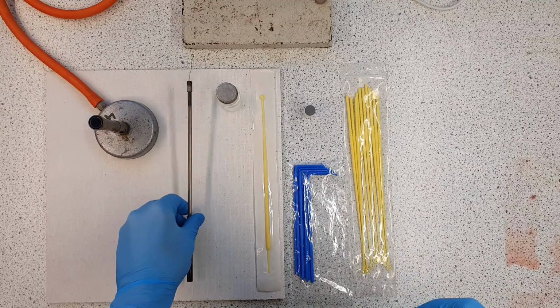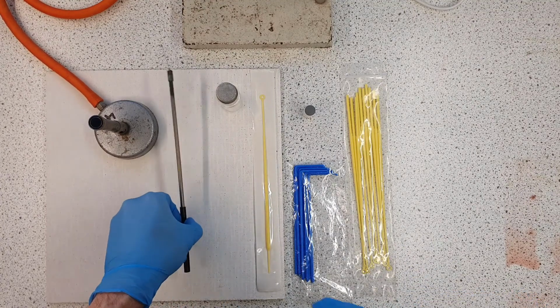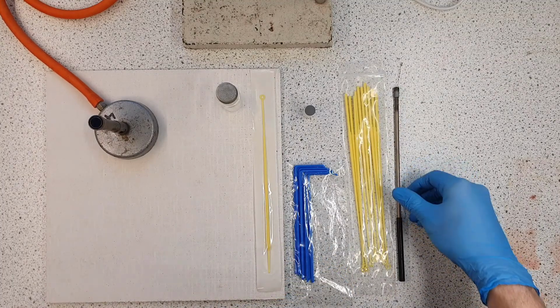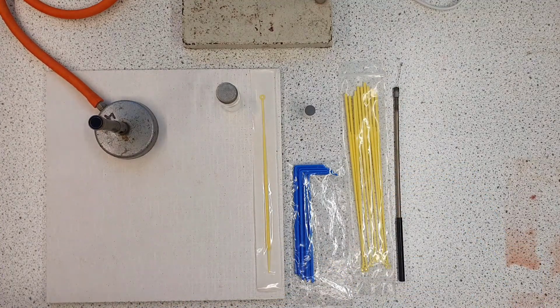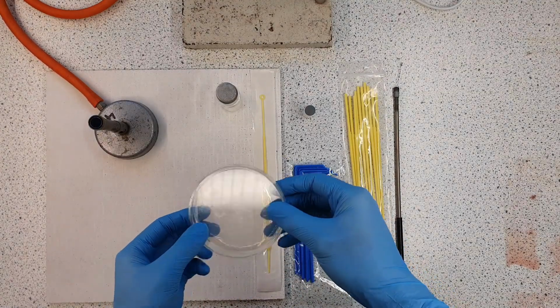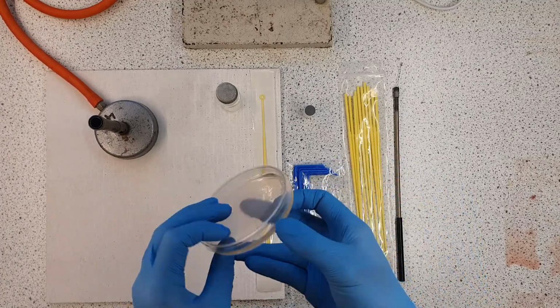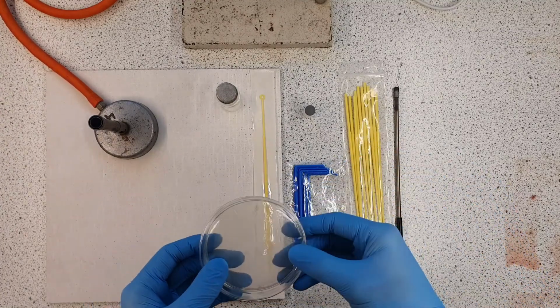And this aseptic technique, the concept of making sure things are open for as little time as possible, also applies to things like petri dishes. So here I have a petri dish in which I set the gel and it's not worked very well. It's a bit splotchy and a bit too thin. So I'm just going to use it as a demonstration.